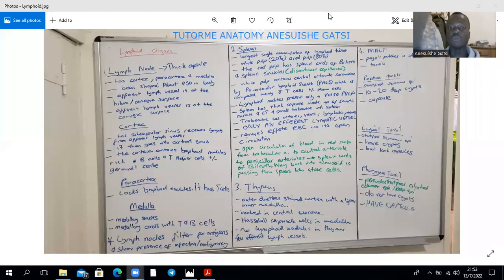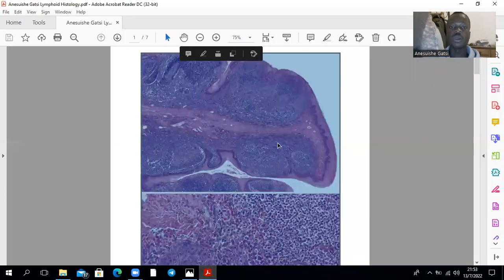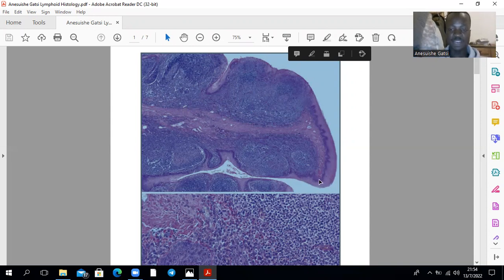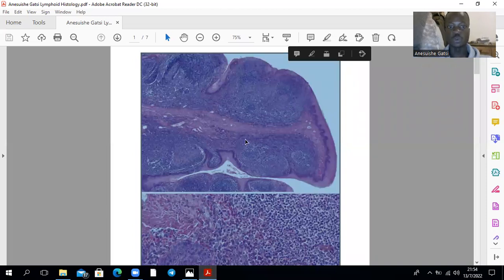Looking now at the slides — this right here is a palatine tonsil. This is the epithelium on the outside: that's stratified squamous epithelium. This is its center, that's its submucosa. These are lymphoid nodules — that's a lymphoid nodule, that's a germinal center right over there, that's a lymphoid nodule, that's a lymphoid nodule. And those in the center are germinal centers that are lightly stained.